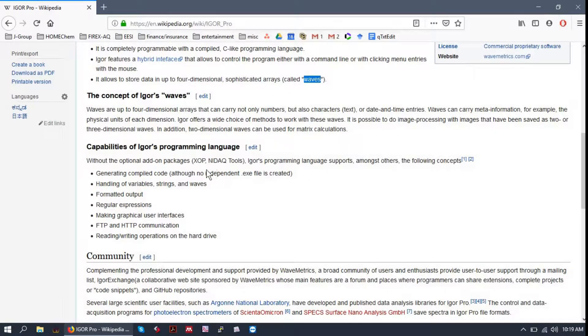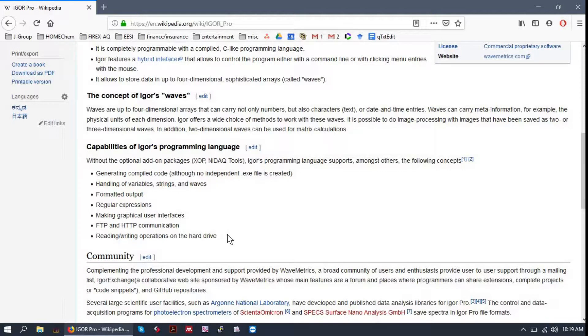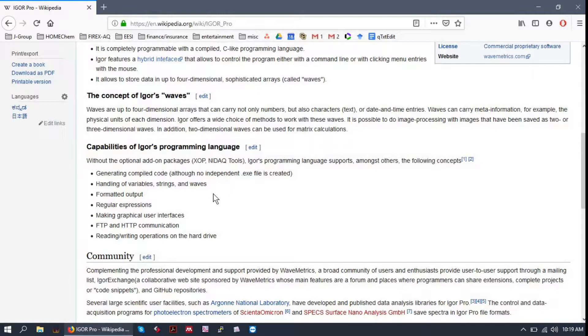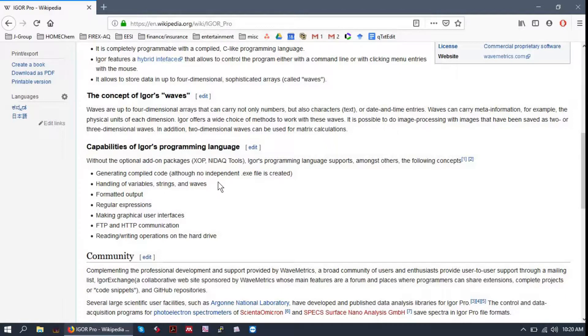Igor is expandable through the use of XOPs. These are basically C, C++ programs to expand the capabilities of Igor. So you can use it as a data acquisition software, or you can run a complex simulation that you've written in C and have the results spit back into Igor. All sorts of things.